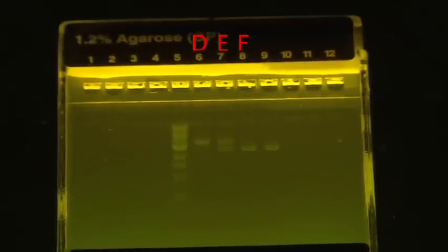In this gel, you can see that lane 5 contains the ladder, and lanes 6, 7, and 8 contain the DNA of 3 suspects. We'll call them D, E, and F. Lane 9 contains DNA found at the crime scene. What I'd like you to do is analyze this gel and answer the following question. Which suspect, D, E, or F, has DNA that matches the DNA from the crime scene? Discuss the answer to that question, and I'll see you when you're done.